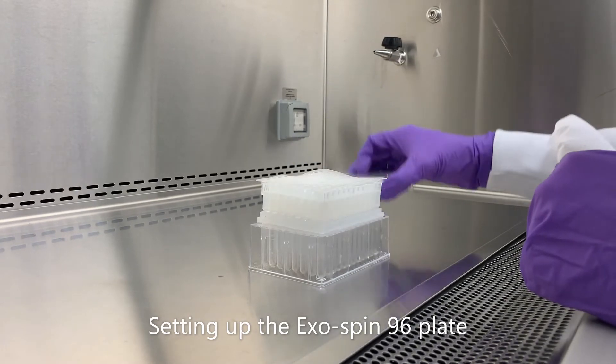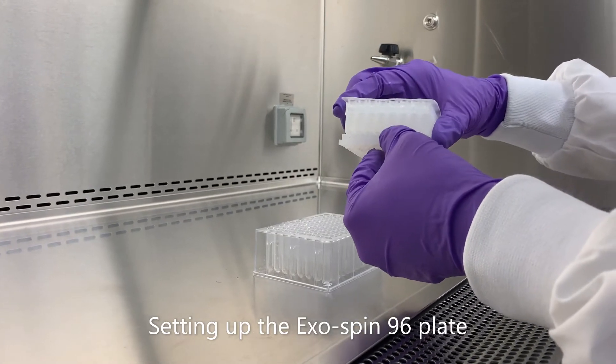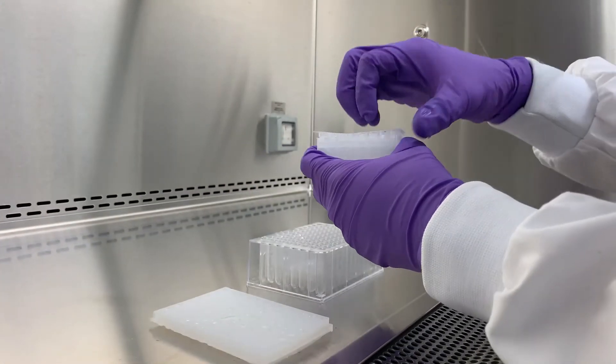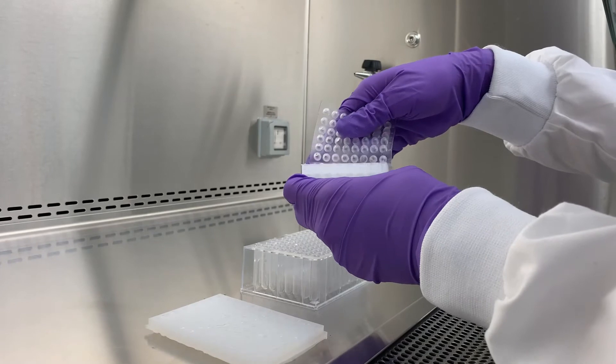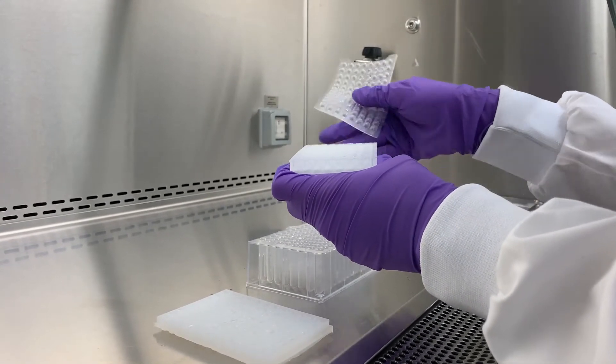Start by removing the bottom sealing mat from the ExoSpin 96 plate, then carefully remove the top sealing mat one strip at a time. As shown, this will help avoid spillage of the buffer from each of the wells. Once removed, place the ExoSpin 96 plate onto the waste collection plate provided.